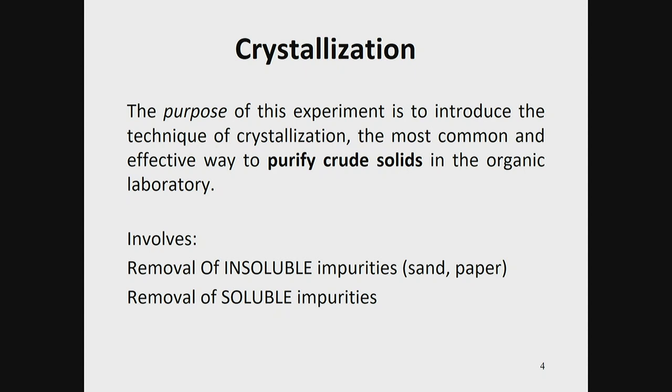Crystallization, okay? So the purpose of the crystallization experiment is to teach you about this technique that is used to clean up dirty solids in the organic chemistry laboratory. It involves two things. It involves the removal of insoluble impurities like sand or paper, things that can't dissolve in a liquid. And then the removal of soluble impurities, those things that can dissolve in a liquid.